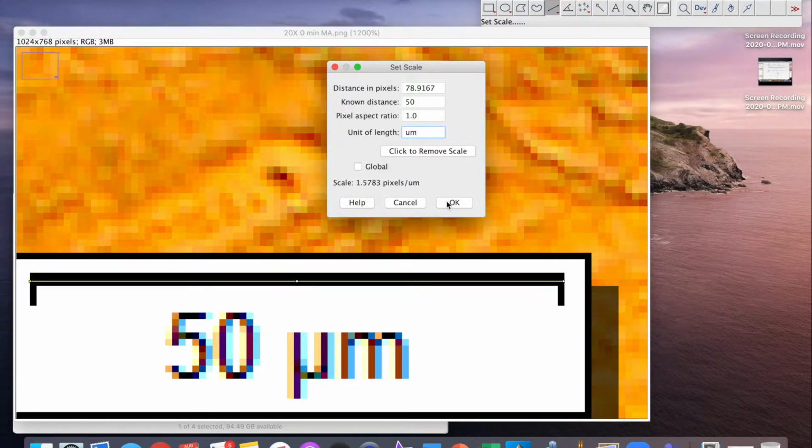And that's why we can eliminate the need for the magnification in our equation. And if we use the tool in ImageJ to calculate length, then that will give us capital L in microns, and this will allow us to calculate the mean linear intercept without the additional need for the other steps.